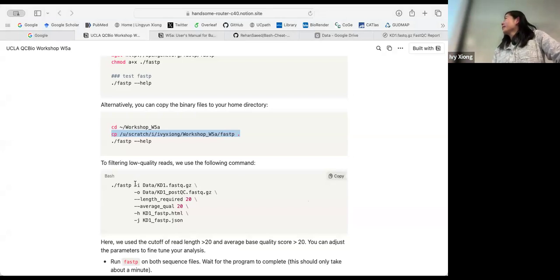So if you're typing, you can just forget about this slash and go through a single line. But I have to say dot slash Fastp for the second line. Just repeat the command. So for a single line, we can try to do that. And then you continue with the second line without that backslash.